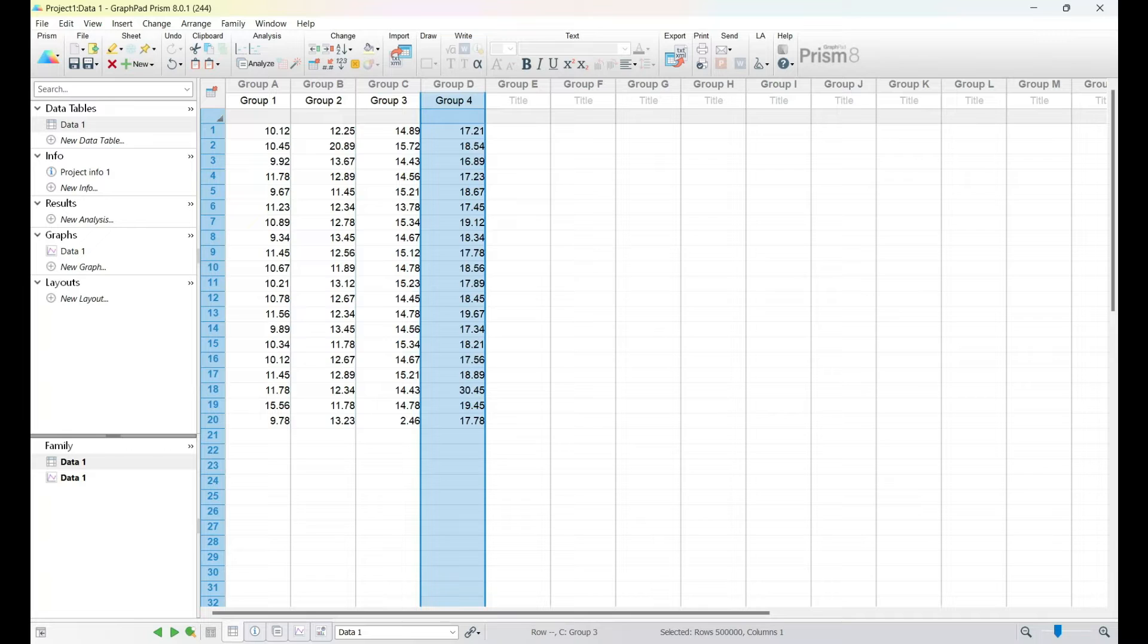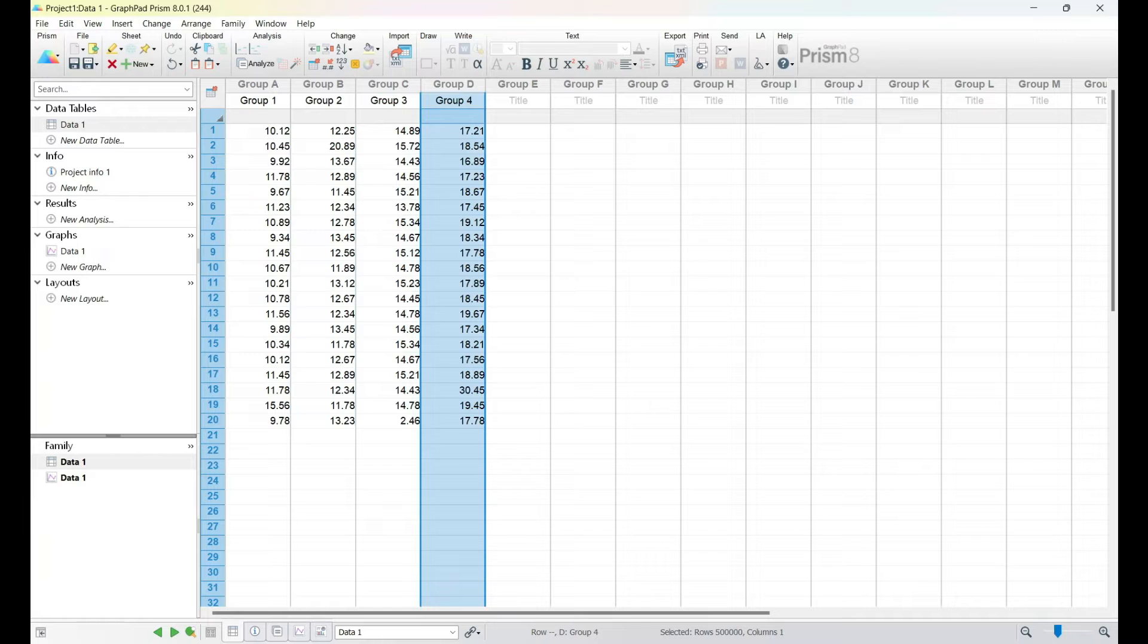It could be anything from experimental measurements to survey responses. Having a clear understanding of your data set is fundamental to accurate and insightful analysis.